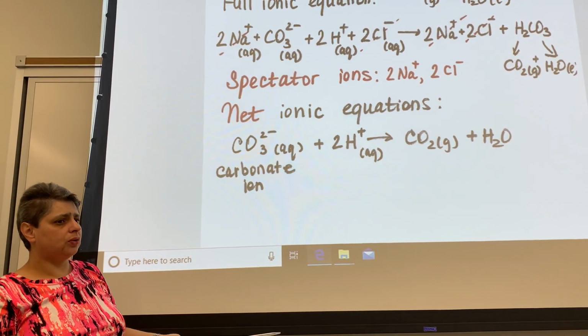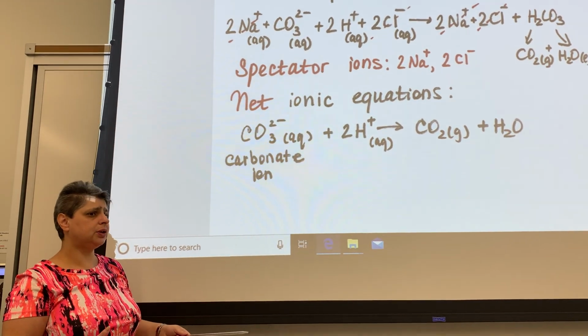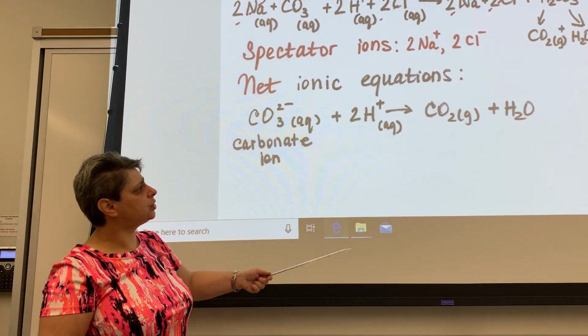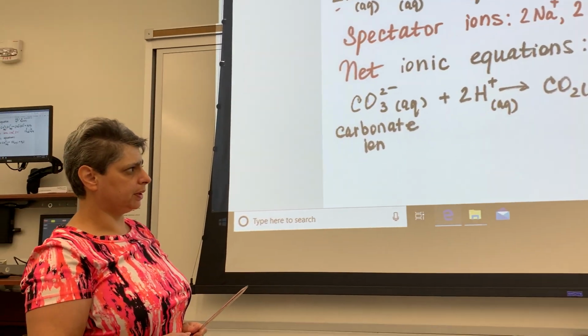So how do we know that CO2 is produced when we're making a cake and we're combining either baking soda or baking powder with, say, vinegar? Well, it produces a bunch of bubbles. So here CO2, having fairly low solubility in water, will be detected as bubbles.